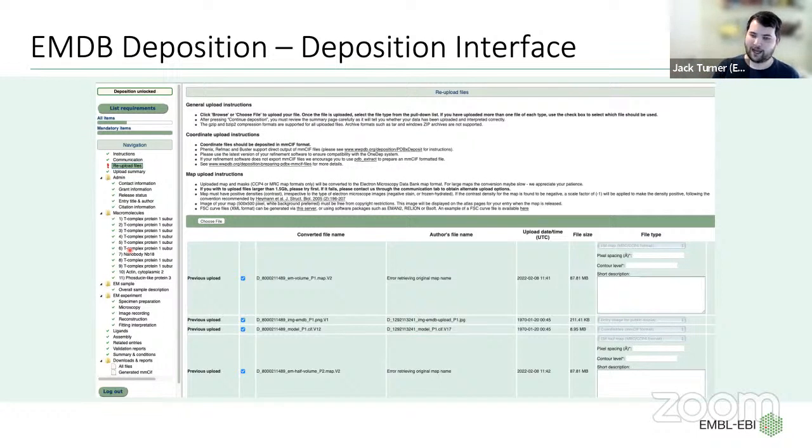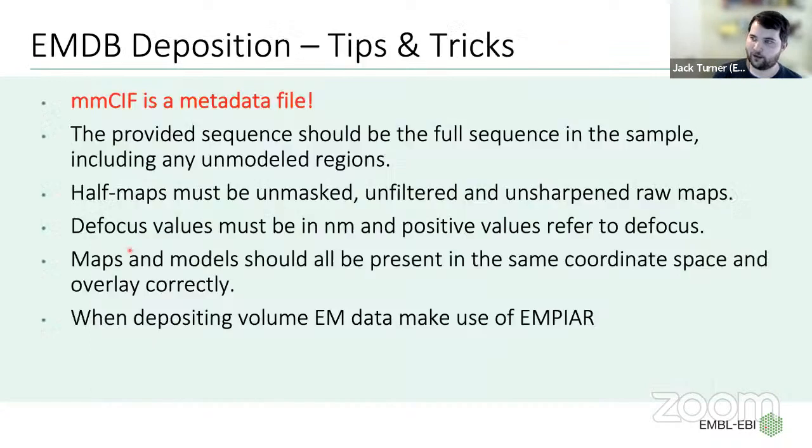And whilst that will have all the atom information as well, it will also have all the metadata information. So you can still search for EM imaging, for example, and find what you need to fill in there. There is also a website with the dictionary. You just Google MMCIF dictionary and you'll be able to find a lot of the things there.